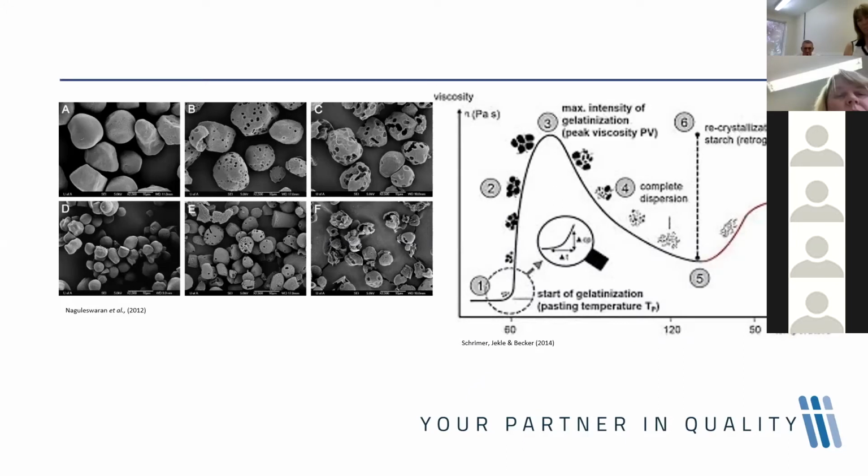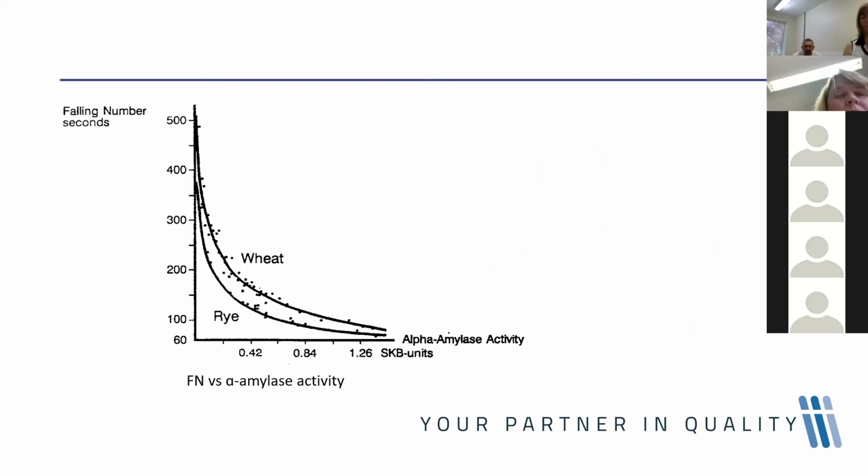Now if you've got a situation where your starch granules have started being acted on by your amylase enzymes, as a result of all those perforations in the starch granule, your starch granule is actually prevented from achieving that maximum expansion. Consequently, that will result in a decreased thickening effect of the starch.